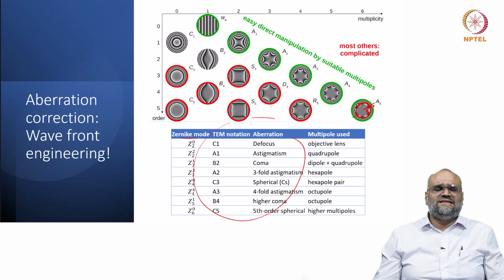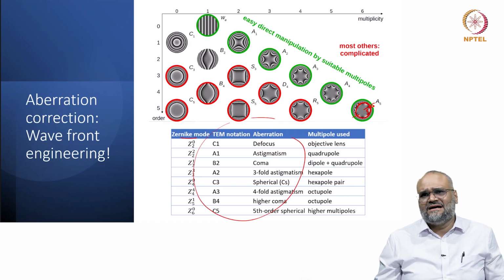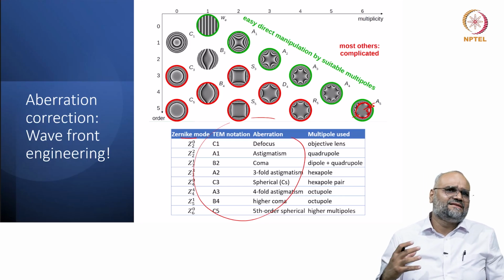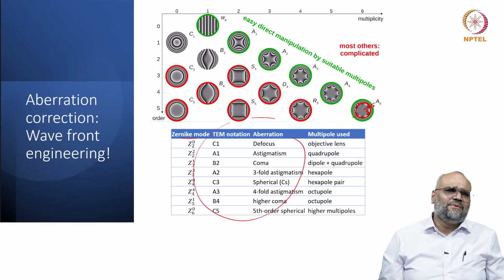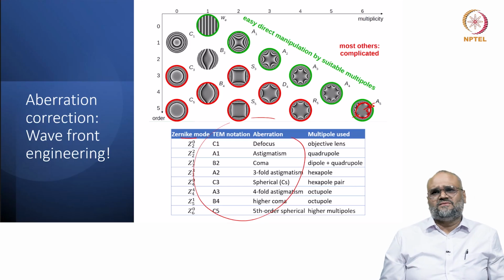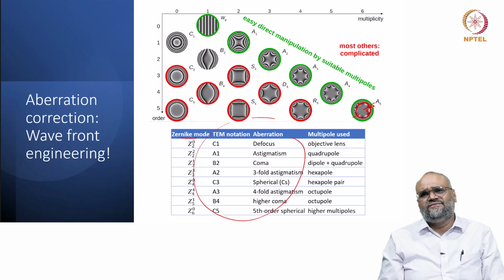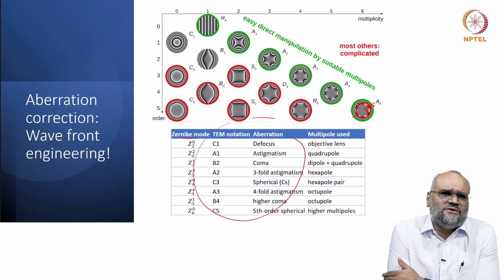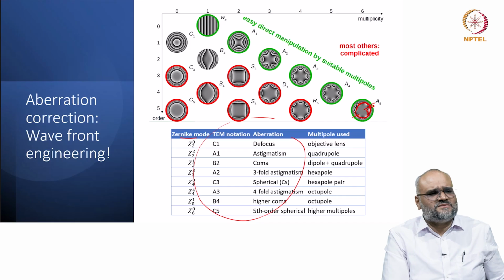And nowadays with this, people have achieved resolutions as low as even 0.5 angstroms, or even, if I am not wrong, 0.3 angstrom, and we are at the ideal limit of aberrations as of today. So, by correcting spherical and chromatic aberration, we have pushed the boundary of the resolution limit in transmission electron microscopes, and this is what you have in most of the modern day microscopes now.